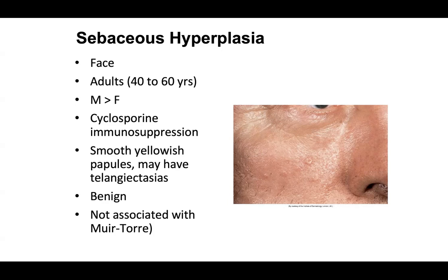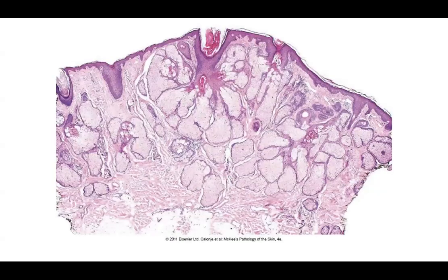Sebaceous hyperplasia is not associated with Muir-Torre. So when you think about sebaceous neoplasms like sebaceous adenoma, sebacioma, and sebaceous carcinoma — which are associated with Muir-Torre — that's not the case for sebaceous hyperplasia. Here's an example: in a sebaceous-rich area like the face or nose, you're going to see sebaceous hyperplasia with several well-mature sebaceous lobules palisading around hair follicles, extending into the deep dermis almost to the subcutaneous tissue. This is a pretty robust example.